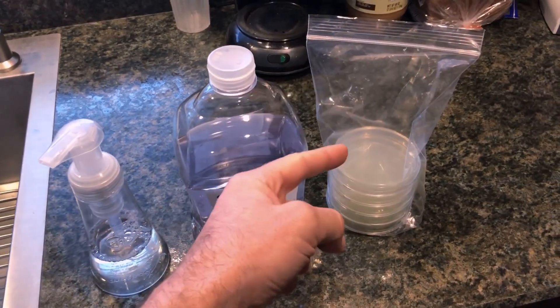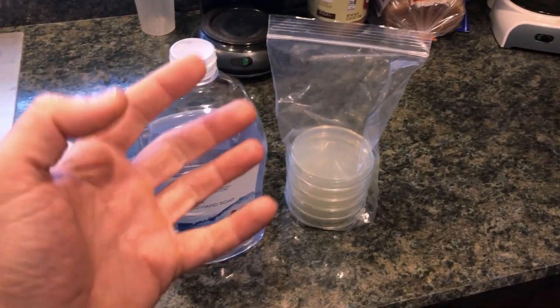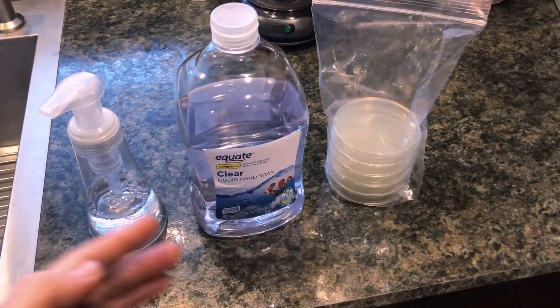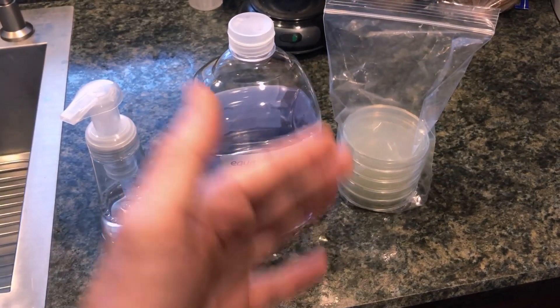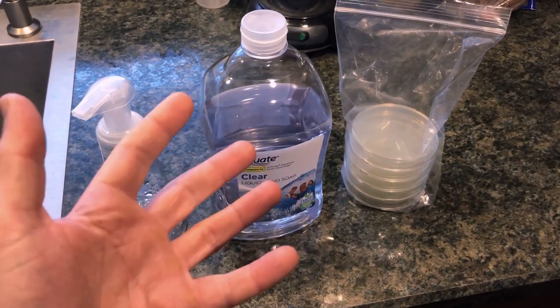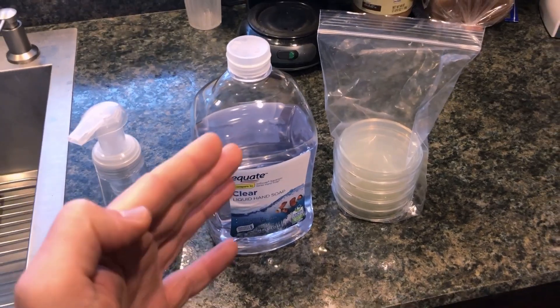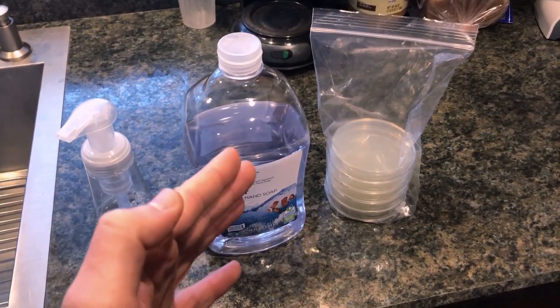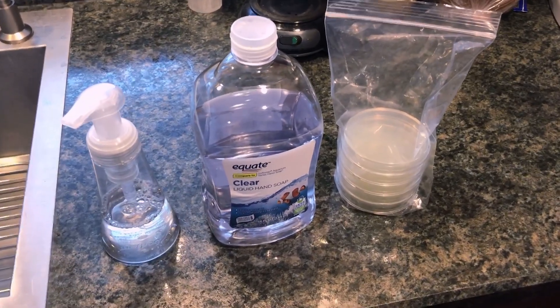I'm also going to take the fifth agar plate and leave it open on the countertop while I am doing all of this other stuff, just to have a control to show how much you might collect from the air — so we can get a better idea of whether the hands are actually dirty or if the plate is becoming contaminated when I open it. I know for certain that's not the case from doing this several times, but just to please the crowd, that's what I'm going to be doing. So let's get busy.